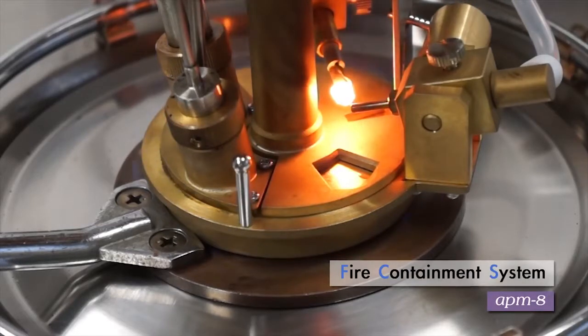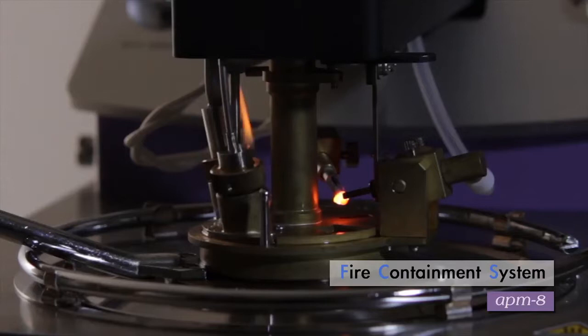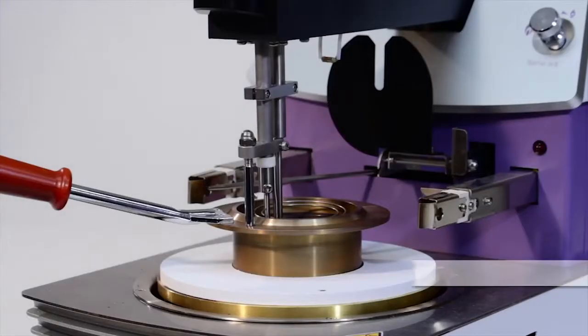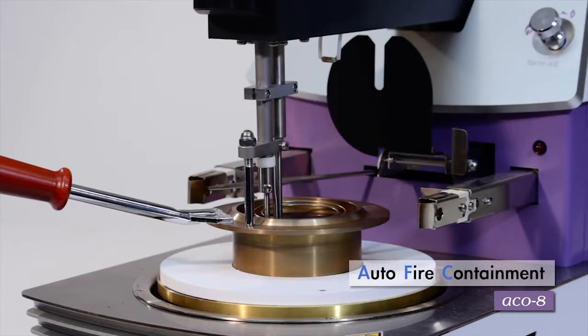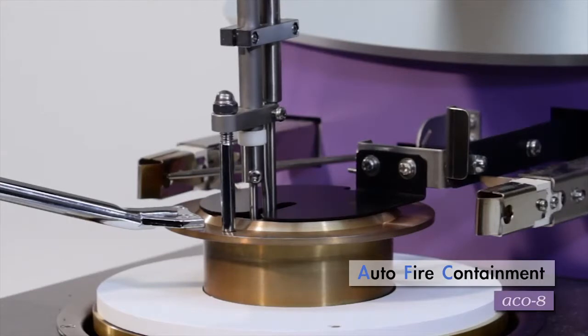Newly added on the Penske-Martin's closed cup model is a fire containment system using nitrogen gas. On the Cleveland Open Cup model, the fire containment lid activates automatically to help extinguish fires when a specimen sustains burning.